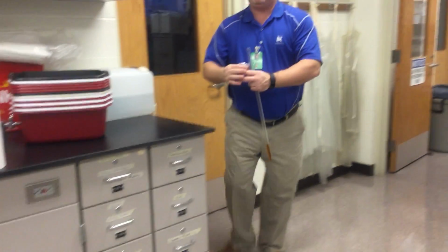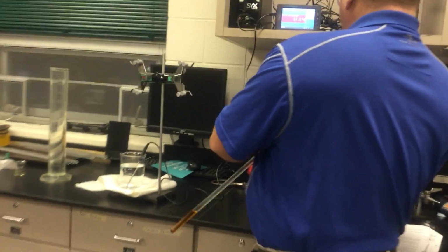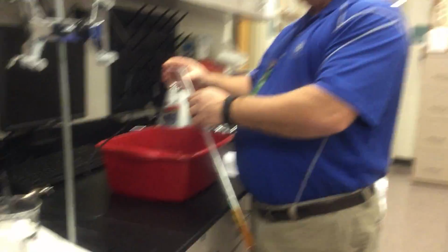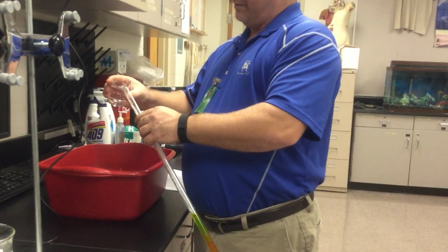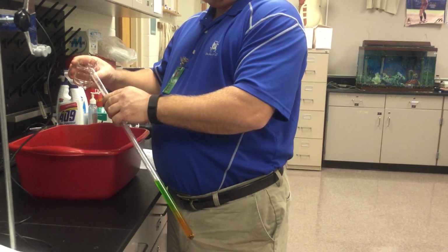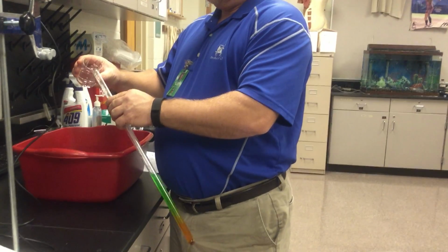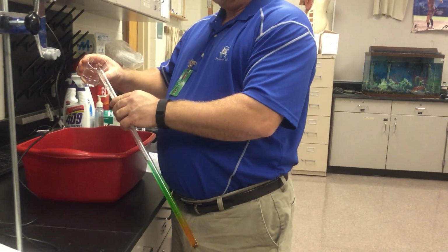I know I should have plenty of this water because this is only 50 mLs, but I'm going to fill it completely, and I'm going to do it slowly so that I layer and keep that acid at the bottom.